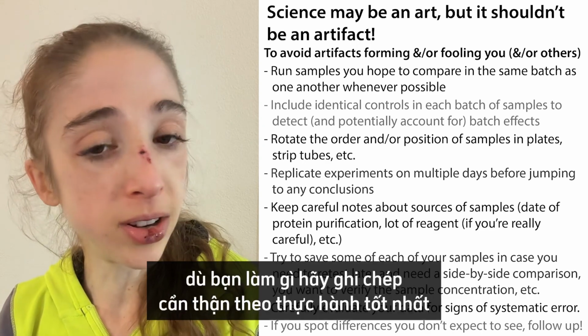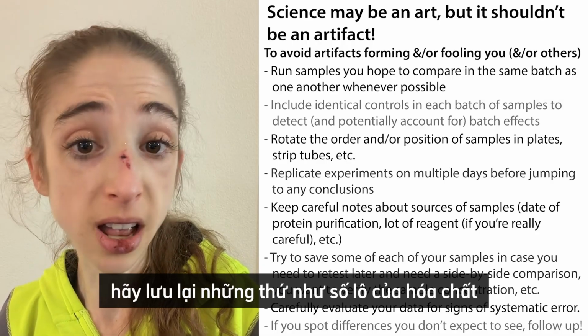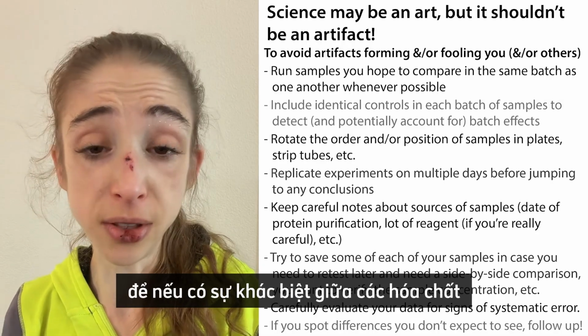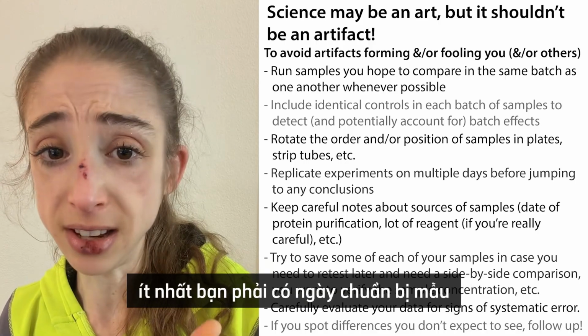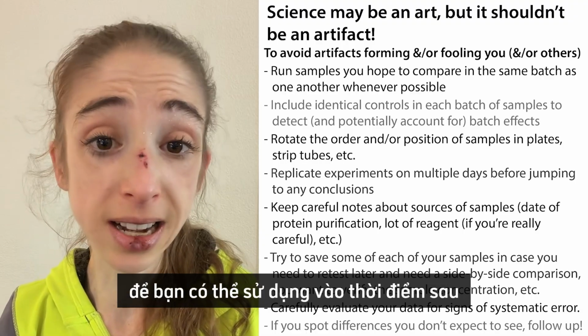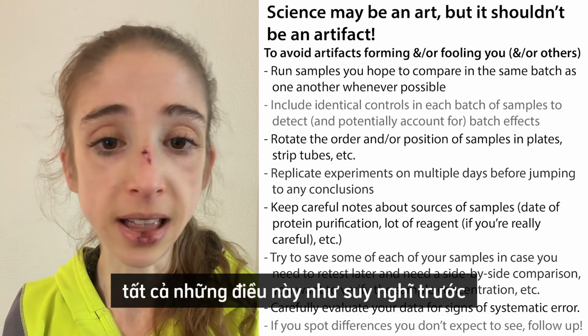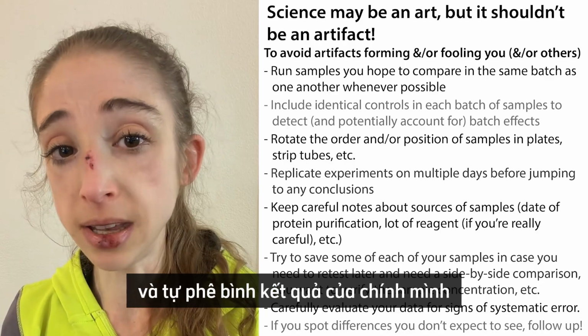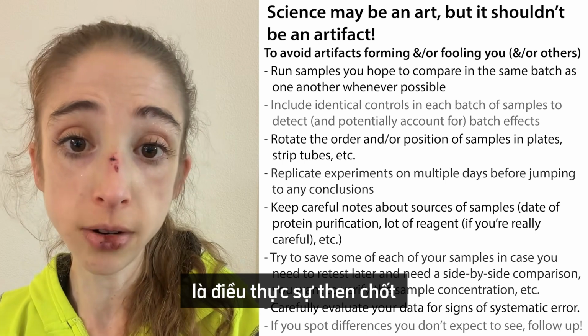Whatever you do, keep good notes. In best practice, you keep things like batch numbers of your reagents, so that if there are differences in the reagents that could be causing batch effects, you can track them. You want to at least have your sample prep dates. Again, save some of each of your samples so that you can use it at a later date and do side-by-side comparisons. All of these things, thinking ahead and being critical of your own results, not just other people's results, is going to be really crucial.